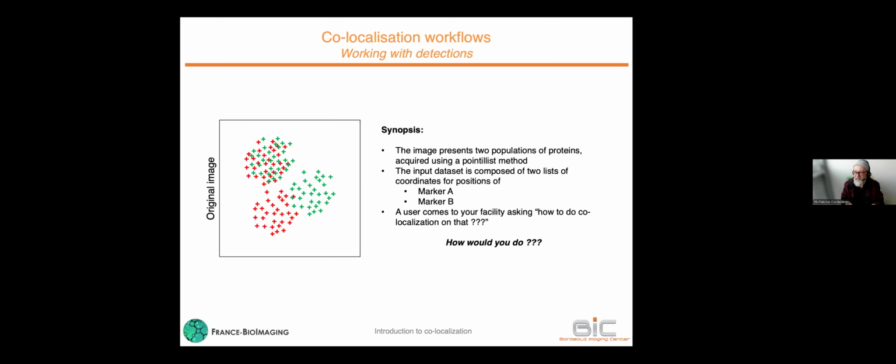I mean, briefly, shortly before we discuss, I think something similar, that we can check the correlation coefficient and then try to do randomization and compare again just to see if what we get could be also random or if it's due to actual colocalization. True. This is one way to go.